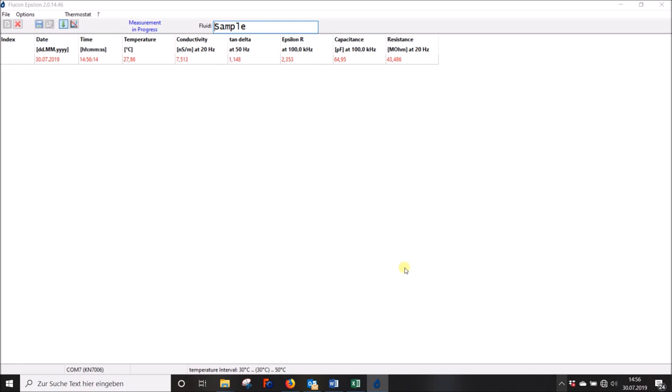The remote control of your thermostat will now be activated and you will find the first row of your protocol displayed in red until the sample reaches the start temperature of your choice. Notice that the bottom of the program window has a status line which not only includes information about your active COM port, system number, and measuring mode, but also your temperature settings.